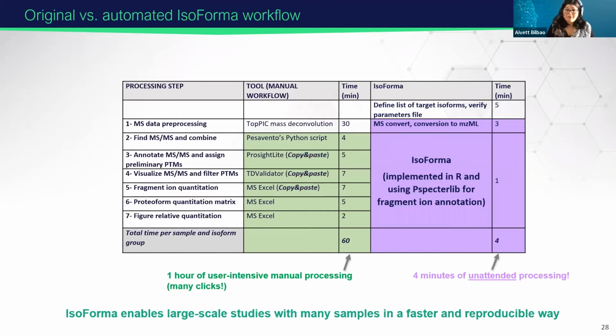With Isoforma, what we wanted is to combine these tools into a single software to automate this processing. And we used MSConvert from ProteoWizard to convert the vendor format to an open format, mzML in this case.